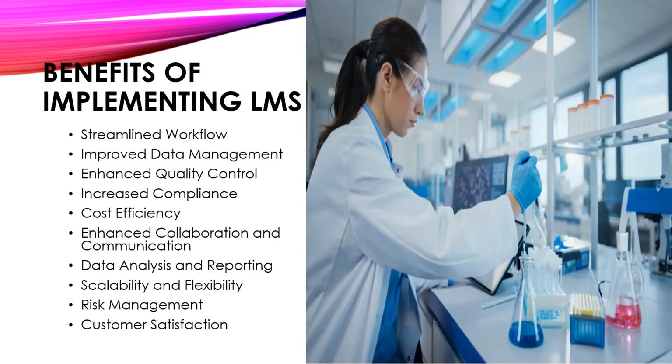Benefits of implementing a laboratory management system. Implementing a laboratory management system often offers numerous benefits to laboratories across various industries, which include the following.